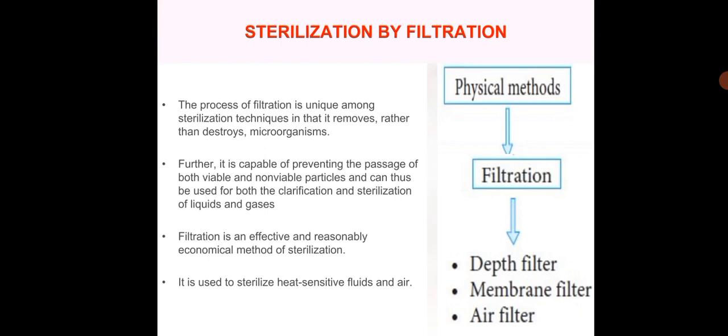Next physical method of sterilization is by means of filtration. The process of filtration is unique among sterilization techniques in that it removes rather than destroys microorganisms. Thus, it is capable of preventing the passage of both viable and non-viable particles and can be used for both the clarification and sterilization of liquids and gases.